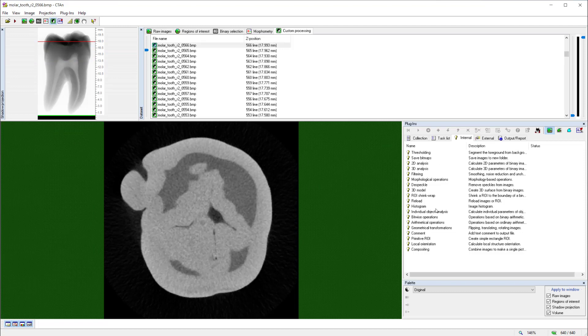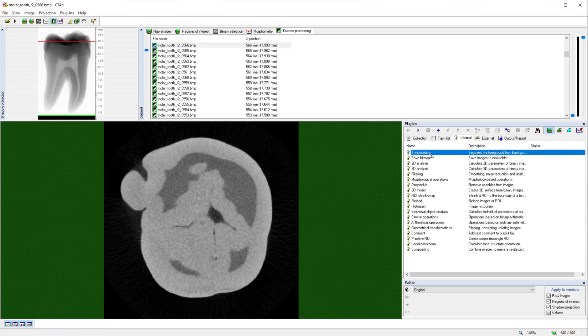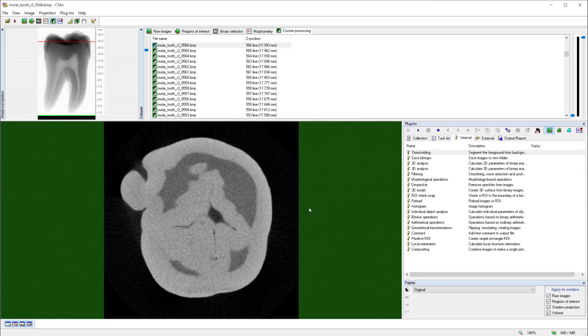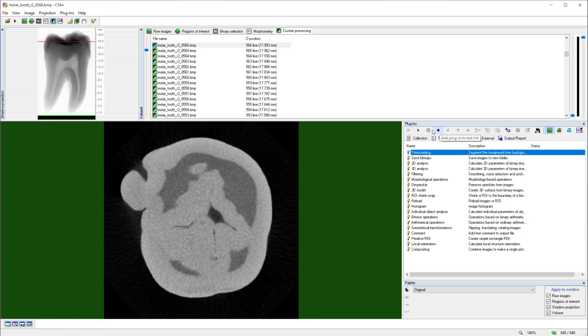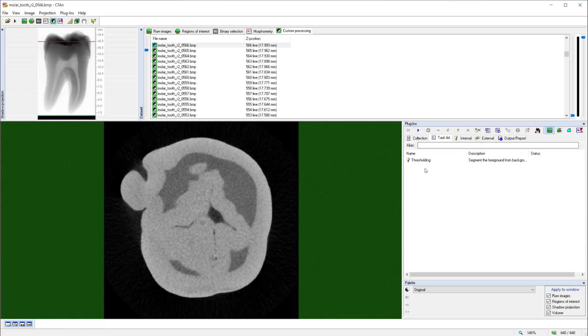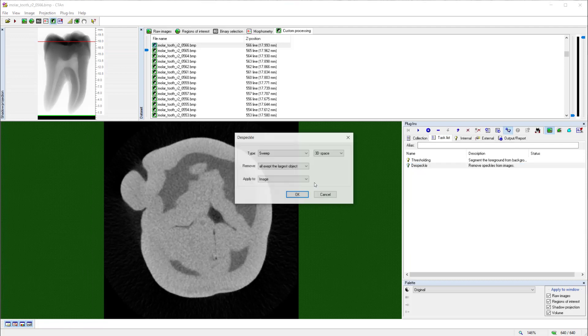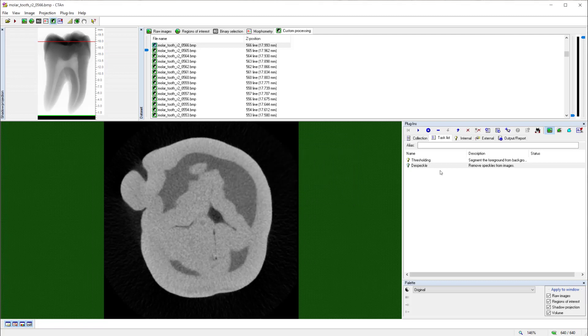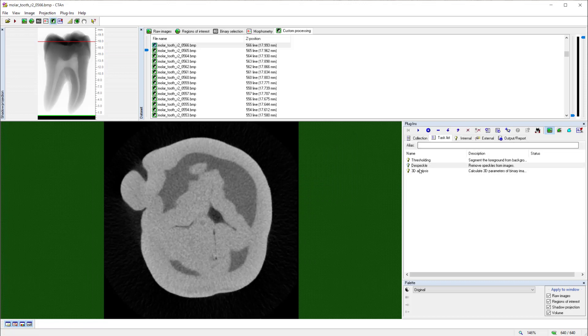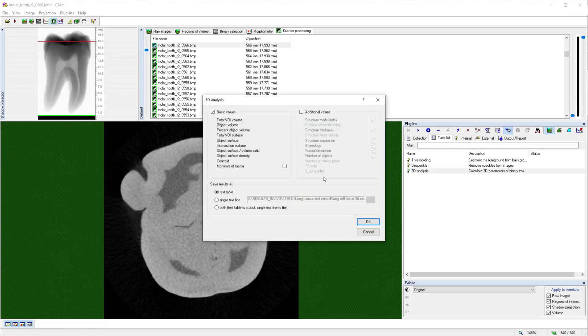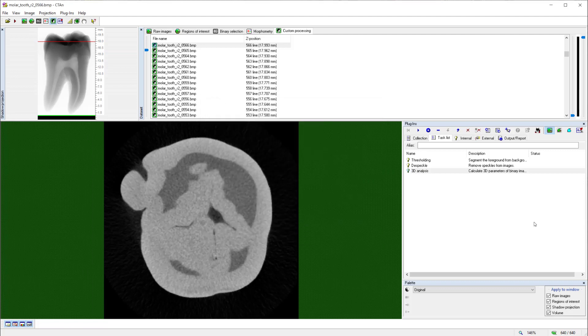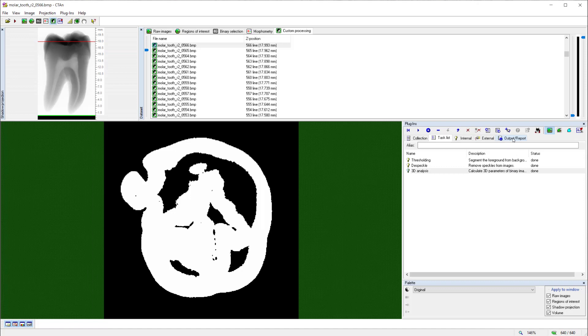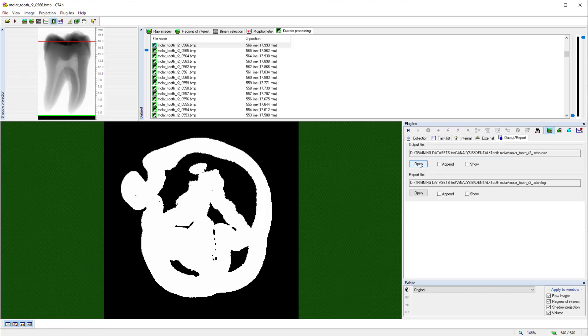And the fifth page, the custom processing page, is a page that allows us to have an extended range of functions and also to put functions in an automated sequence. For example, I could choose thresholding and set it with a value of 124 and 255 to binarize the enamel. By clicking plus in the top button row, I add this to the task list. I add a second function called DESPECLE, in which I specify to remove any disconnected objects by sweeping all except the largest objects in 3D space. And finally, I perform 3D analysis to measure the volume and the surface area of the enamel. These three operations, once listed in the task list, can now be run in an automated sequence.